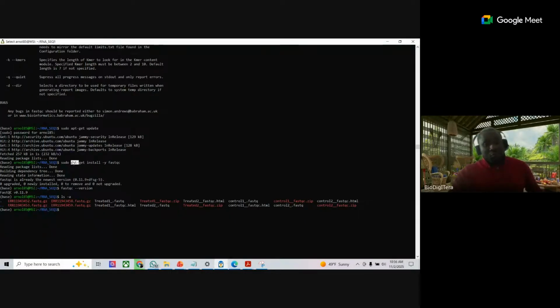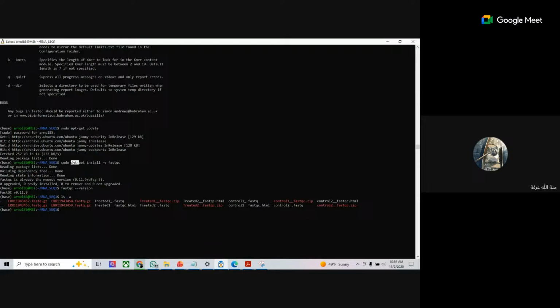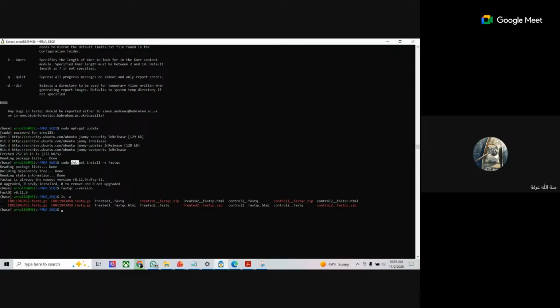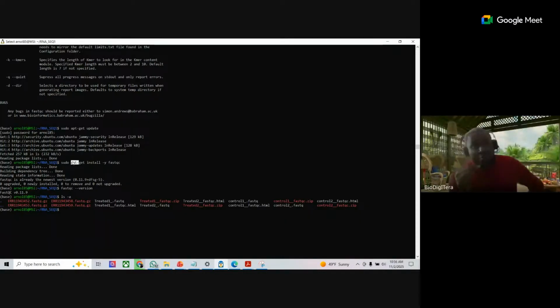Some will be yum. Some will type sudo yum. But mine here is for Ubuntu. Give me another version like that. But I think it works. I cannot now go with you to check the distribution of your Linux. That is a Linux class. If I have to check the distribution of your Linux, we will be starting doing Linux. But right now we should not do that. If it's not working after the class, I can help you. We check together, but not now.